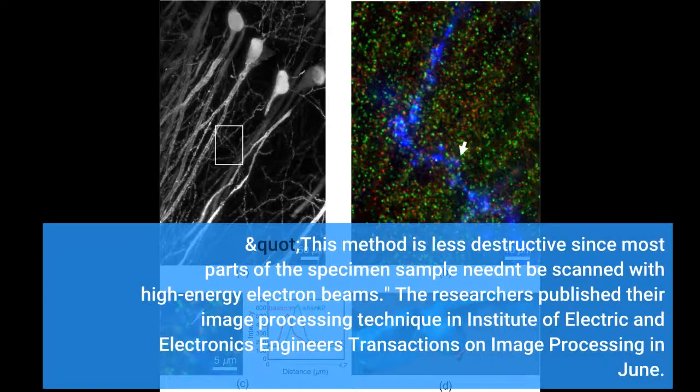This method is less destructive since most parts of the specimen sample need not be scanned with high-energy electron beams. The researchers published their image processing technique in Institute of Electrical and Electronics Engineers Transactions on Image Processing in June.